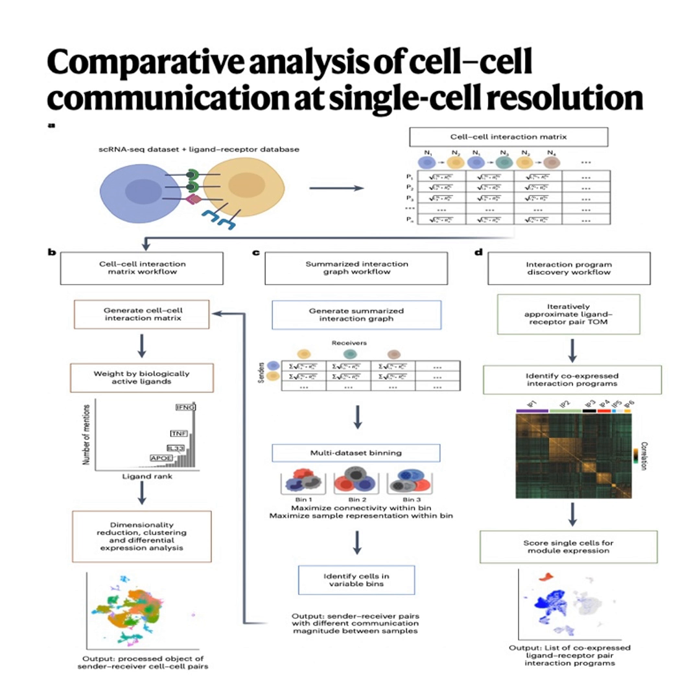Yeah, that's the scaling challenge. They offer two main ways around this, two workflows that avoid those pitfalls. The first one, let's call it workflow 2, is built around binning. This is especially useful when you want to compare samples like healthy versus diseased tissue. Binning. Like putting things into categories. Isn't that a form of aggregation? But it's a very, very high-resolution, carefully controlled form.